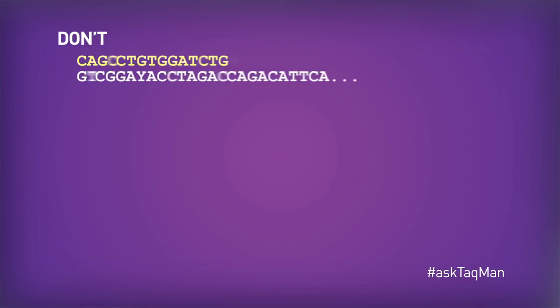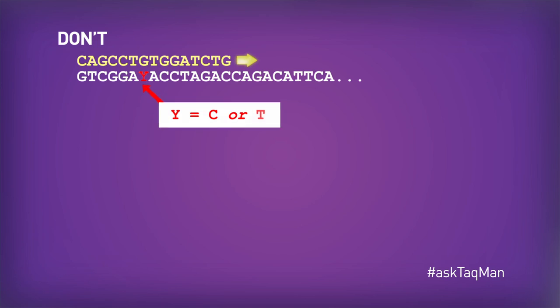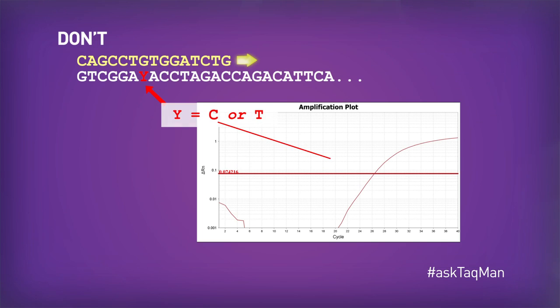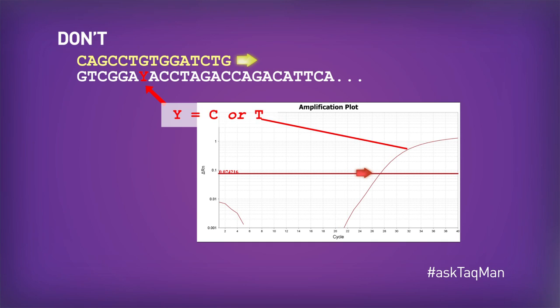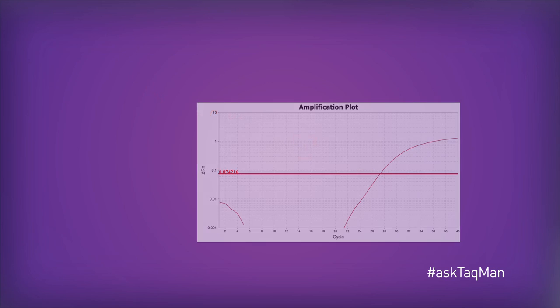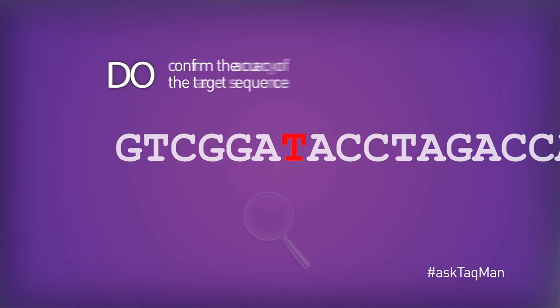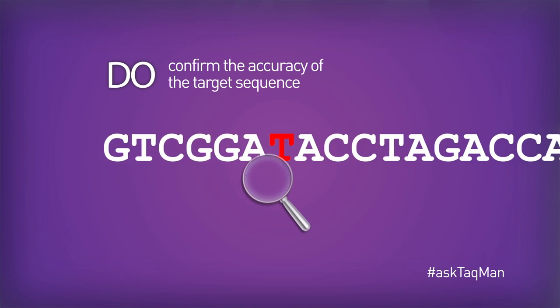Second, and this is critical for quantitative experiments, don't design oligos to a mismatch or to a known polymorphic site, as this might cause inefficient binding during the first few PCR cycles and shift CTs to the right. Instead, always confirm that you have the correct sequence.